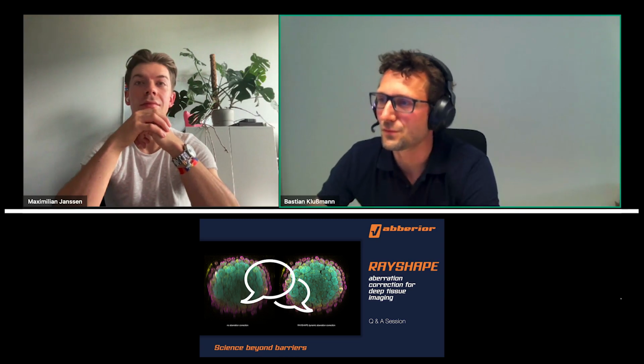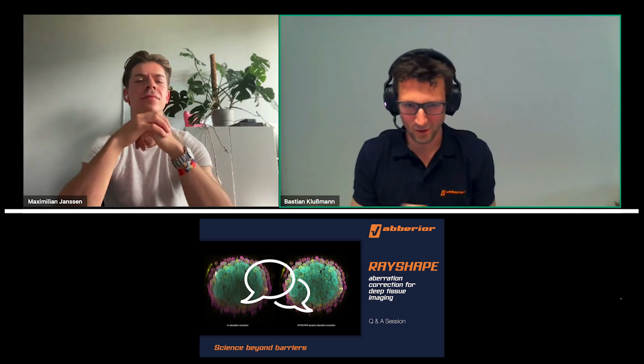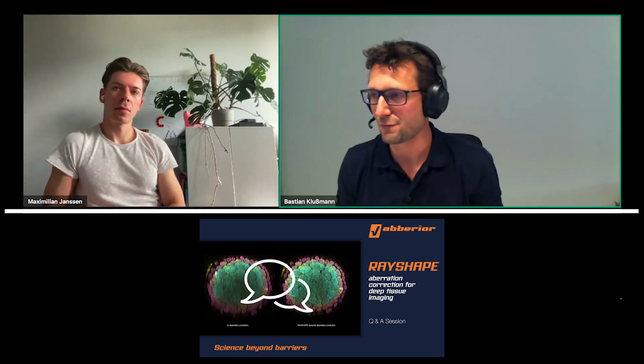Further questions? Okay, here is a question about suggested dye pairs for time-gated imaging, which is a little bit off topic. The one thing we can recommend is our Star Orange dye and CF594 by Biotium, just as a recommendation. There are others out there. We don't have a specific chart for that. There you unfortunately have to do a little bit of your own research.